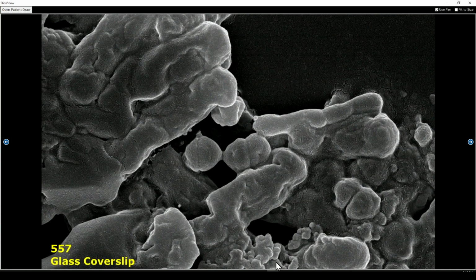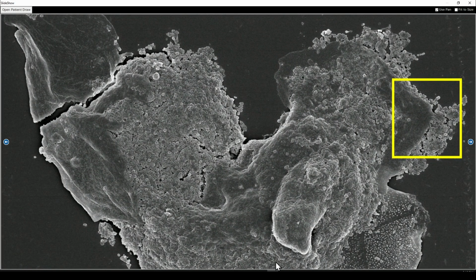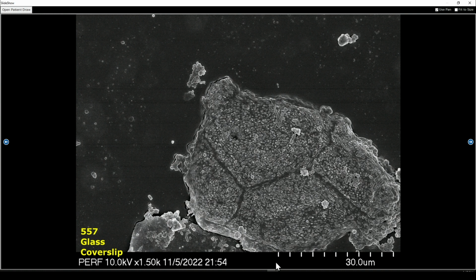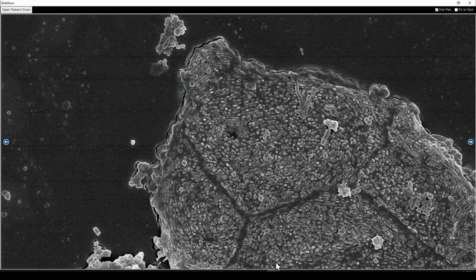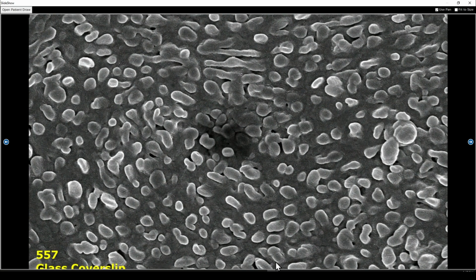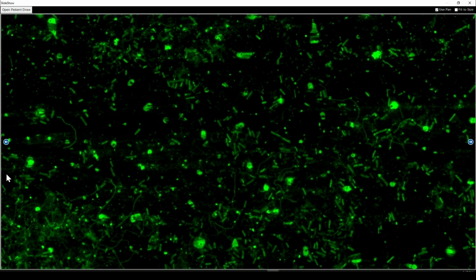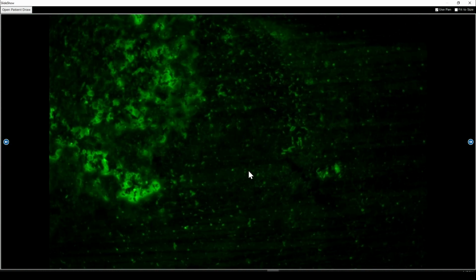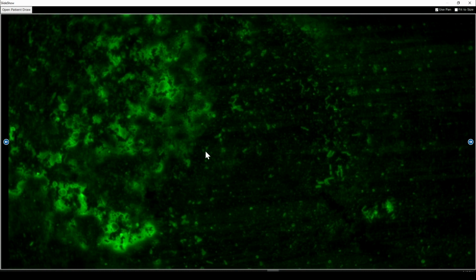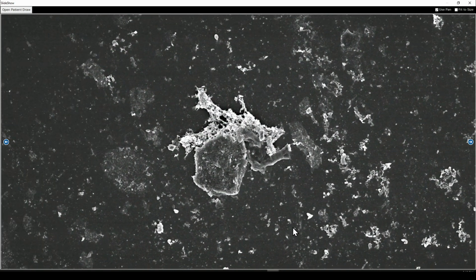And in our culture experiment, you can see that there is this detachment taking place. So you have your typical biofilm that's difficult to identify, and then you have planktonic bacteria. This was very interesting in the culture experiment, where you can see the entire biofilm is almost budding these bacteria out. And here you can see where we stained a wet specimen, and you can see individual bacteria, but you can also see this greenish area that is actually the biofilm glycocalyx.